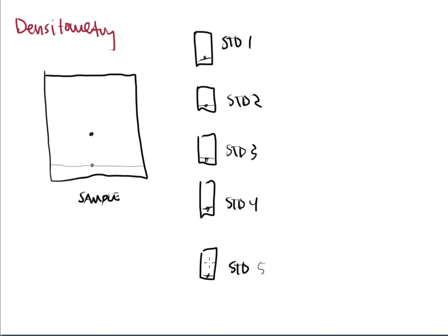And what will happen is that all of these plates will develop at the same time. And they're all the same standard, so they'll go up to the same distance every single time. And if my sample goes up to the same distance, then I can say, yes, my standard is present, so therefore I at least know that that component is present in my mixture. Then what would happen is that I would take these standards and I would basically put them onto a machine. And the machine will scan these spots.